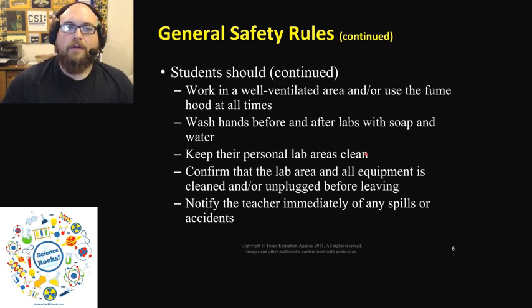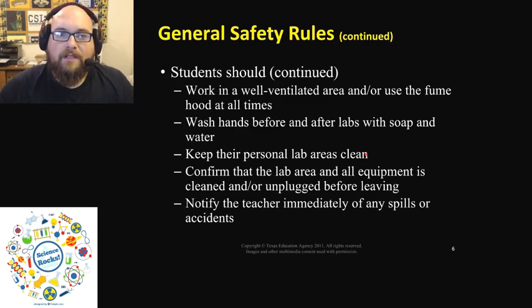You should also know that you should work in a well-ventilated area and use a fume hood. Unfortunately, we do not have a fume hood because we will not be working with chemicals that require that particular safety step. But as you get older, you will learn and use a fume hood, which helps protect you from noxious gases that may develop from an experiment or an activity.